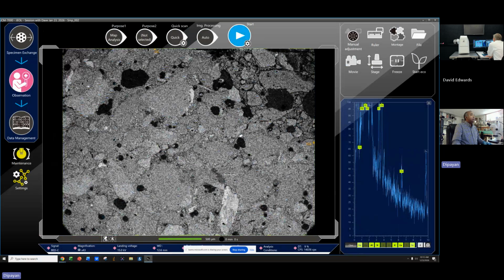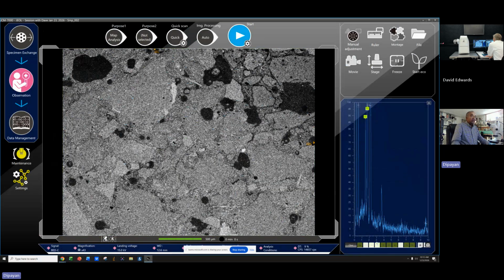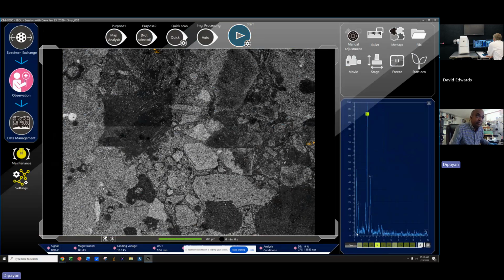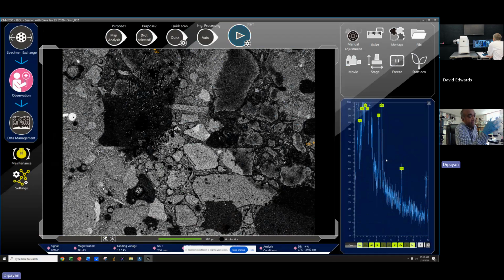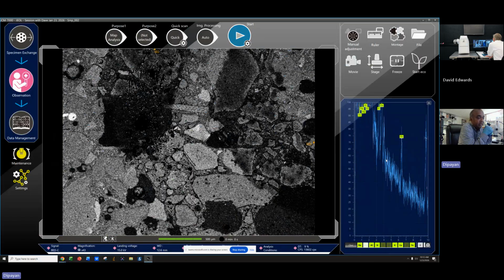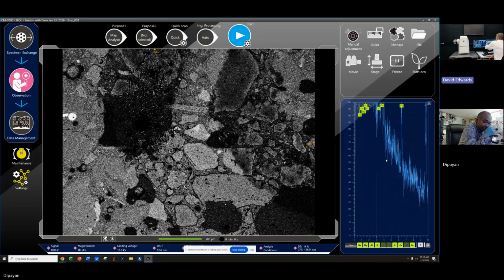Now let's look at any particular area. Now you see the live image immediately started coming. But that live image will be completely blank if I don't use the unit for a while, so then I have to go through all this shutting down to reactivate the live image. Weird. That shouldn't happen.